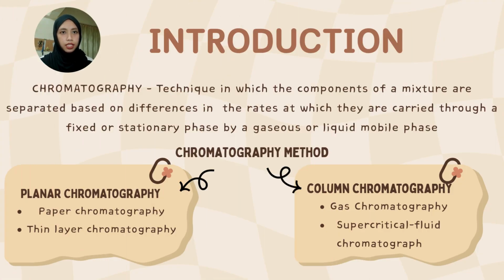Hi, my name is Nur Shazwina, and I will explain about chromatography. Chromatography is a technique in which the components of a mixture are separated based on the difference in the rates at which they are carried through a fixed or stationary phase by a gaseous or liquid mobile phase. The first one is planar chromatography, and the examples of planar chromatography are paper chromatography and thin layer chromatography, or TLC. The other method is column chromatography, and the examples of it are gas chromatography and supercritical fluid chromatography.